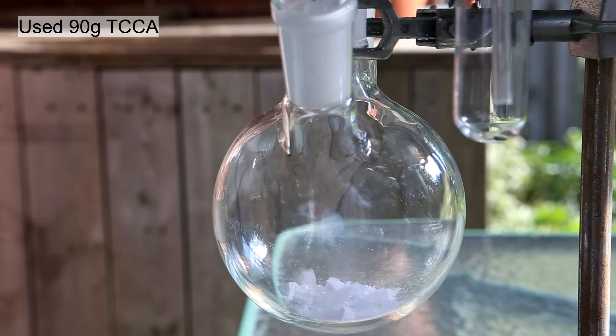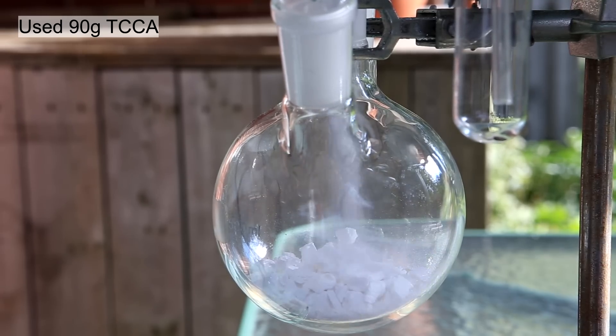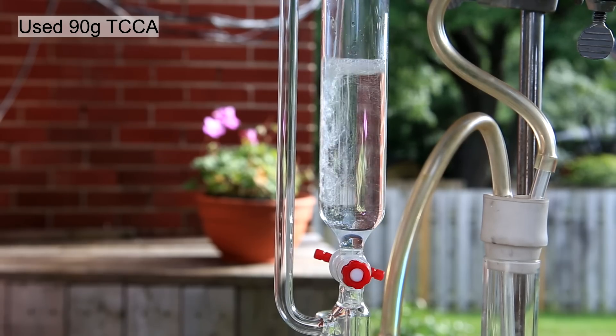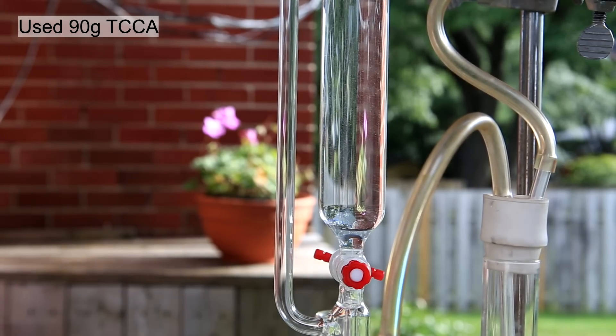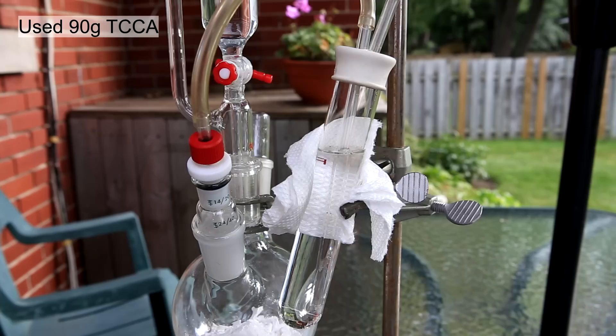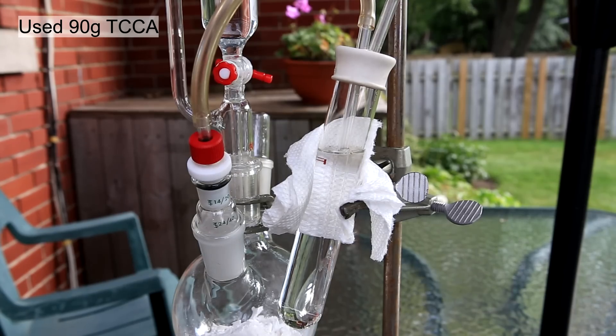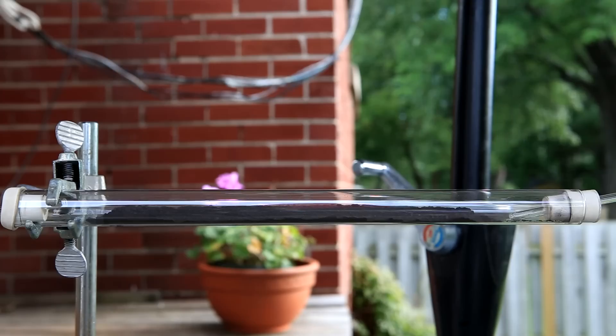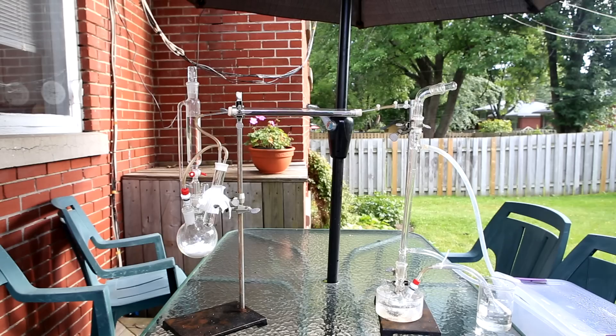To the chlorine generator I added 90 grams of crushed TCCA tablets, then filled the addition funnel with a 50-50 mixture of hydrochloric acid to water. To the test tube gas bubbler I added concentrated sulfuric acid. The septum is fitted snugly to the tube and the chlorine generator is complete. I then weighed out silicon metal and put it into the reaction tube and sealed it. The entire apparatus was totally sealed to the outside and every joint was lubricated with a little bit of sulfuric acid.